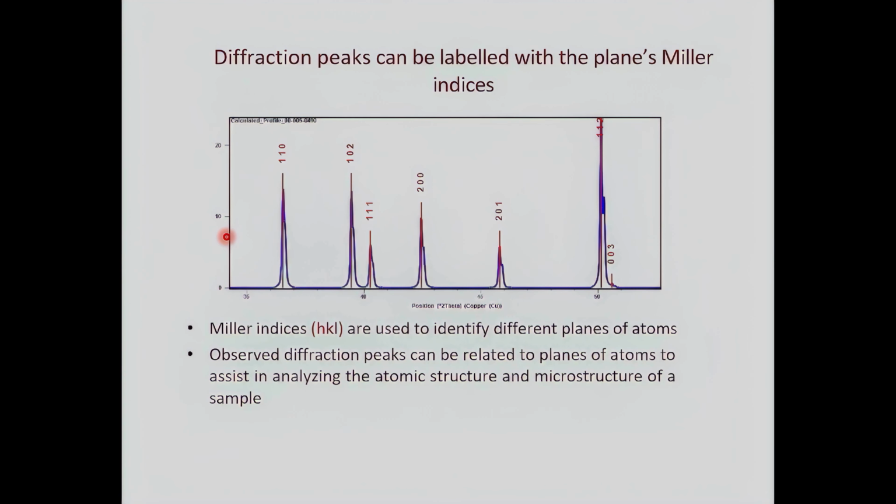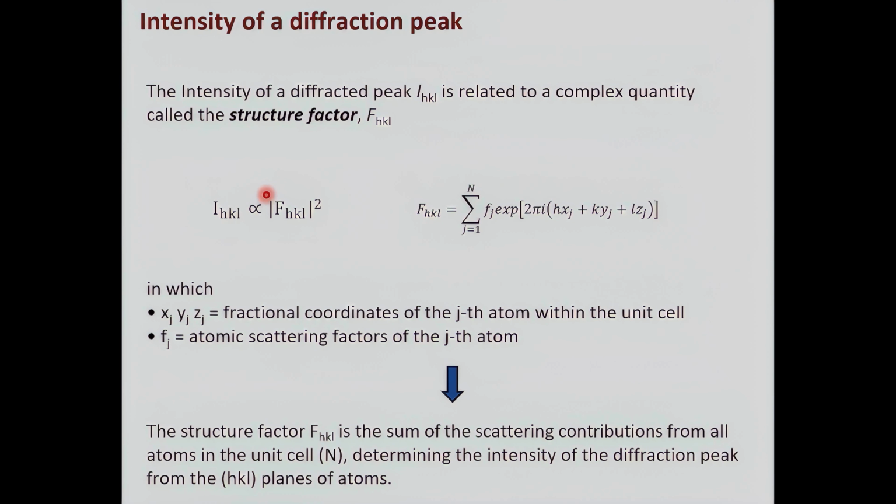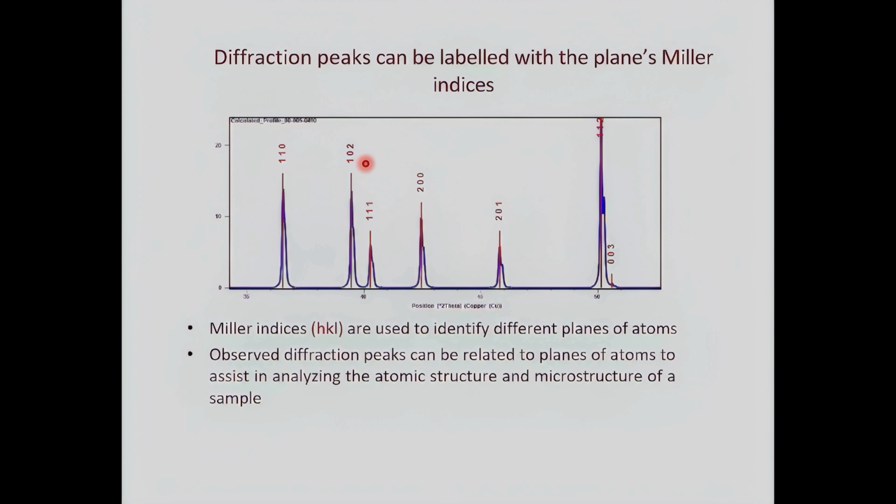Then, if we collect a diffraction pattern like this, we can assign to each peak the corresponding set of planes from which each peak is generated. Okay, but when I collect this signal, what is important?